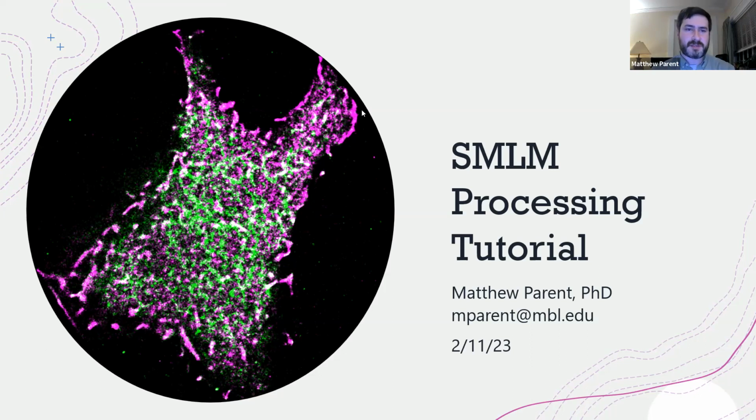What you're seeing here, this first image, is a super resolved NIH3T3 cell with a viral protein called hemagglutinin in green, and in purple, this cellular marker that marks PIP2, a lipid. So we were looking at connections between viral proteins and cellular components.